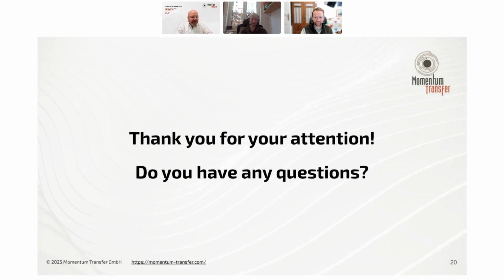Brilliant. Is there a way to include peaks that were not added automatically? Yeah, I think you showed that: you can just click on the image. I hope, Fanny, that was answered.